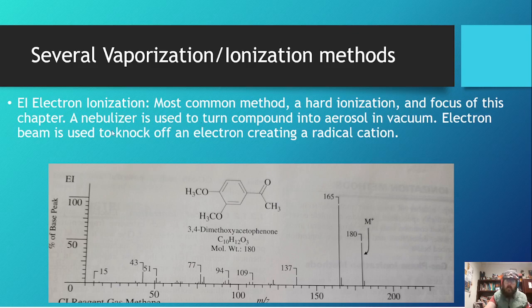So, I'm going to go through a couple different ionization methods. While most people will use mass spec as just an extra tool in their toolbox, there are some schools that will focus entirely on this. Purdue has an analytical chemistry department that is world renowned for its developments of mass spectrometry techniques. Basically, they're developing new techniques, new ways. They're better understanding some of the fragments and how they form.